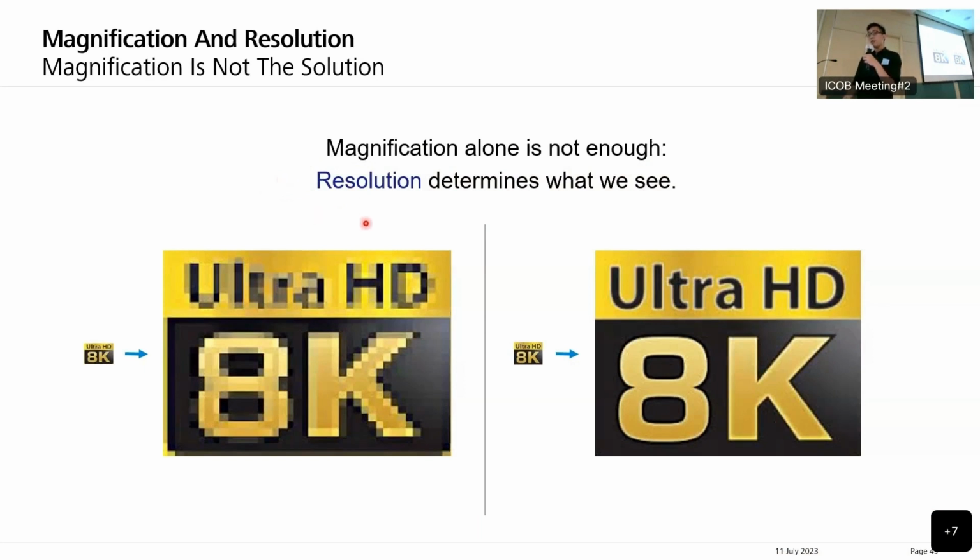Let's compare the image on the left and the one on the right. You can see even if we use a microscope to take a tiny data set like here, then we transfer our data to our laptop or PC, then we enlarge the data. The image with high resolution can actually provide good magnification for your research.